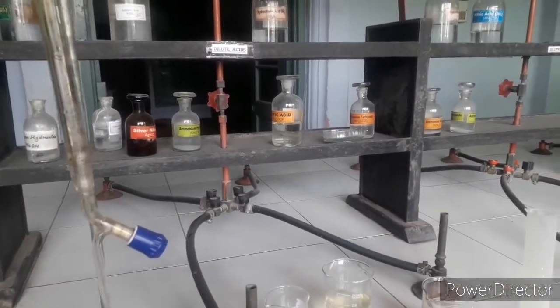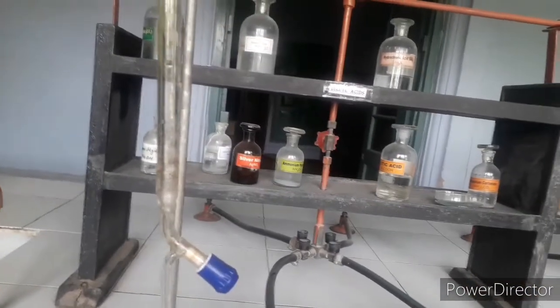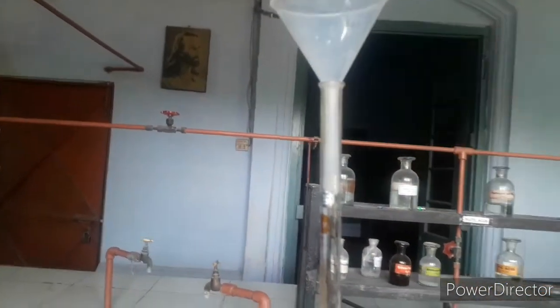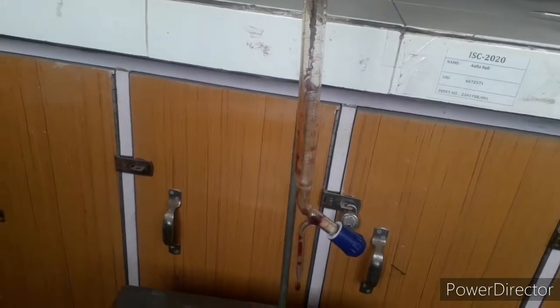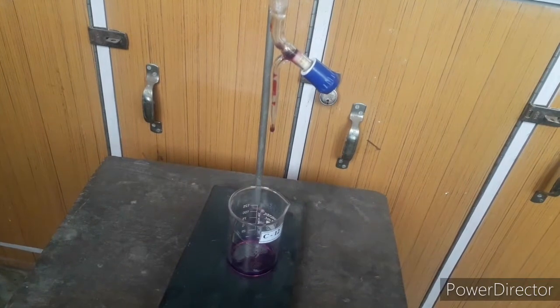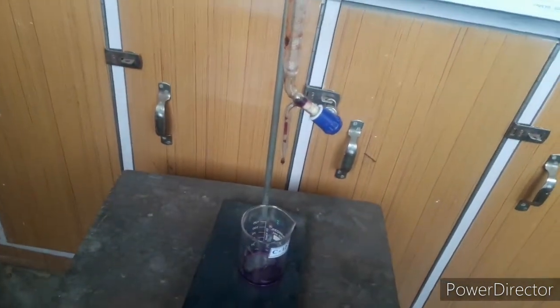To rinse the burette with KMnO4: open the knob at the bottom, place a funnel on top, and pour a small amount of KMnO4 — about 5 to 6 ml — through the funnel. You can see it coming down and out through the open knob. I've collected it in a separate beaker. This rinses the entire burette. Then close the knob.